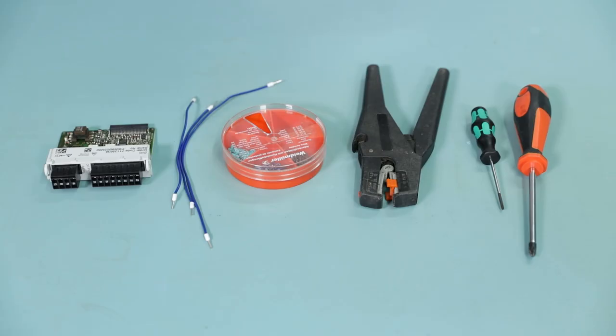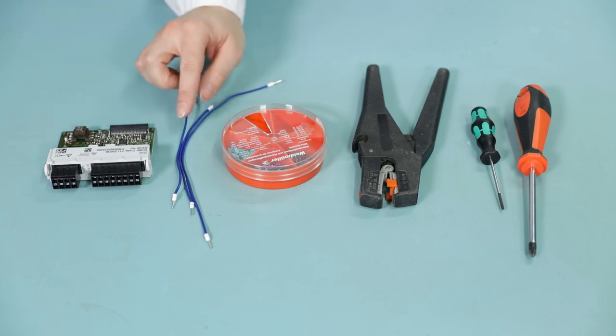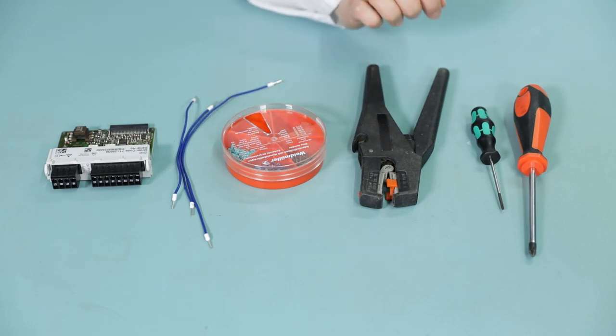For installation, the following components are required and not included in the delivery: the DIO module for the Liquiline transmitter CM44, three connecting cables approximately 20 cm, they will be added soon to the scope of the delivery but not so far, ferules, a cable stripper and screwdrivers.